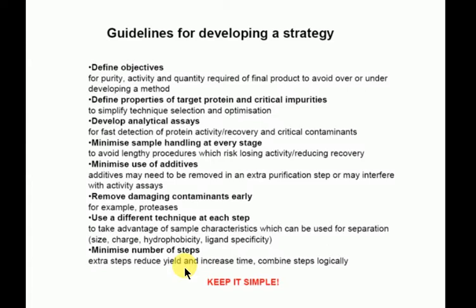So what's your assay then? You need a means of determining how much of your selective protein is in there, what its activity is. I've mentioned here minimize the use of additives. I'll come back to that later. The more things you add in, you've also got to consider that they're kind of contaminating your solution too.